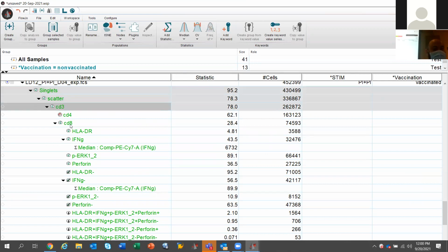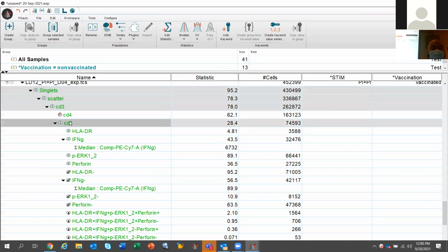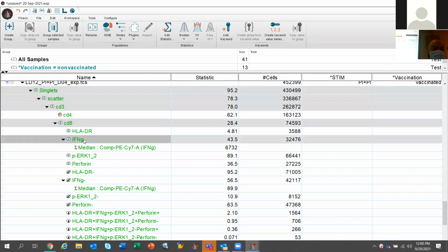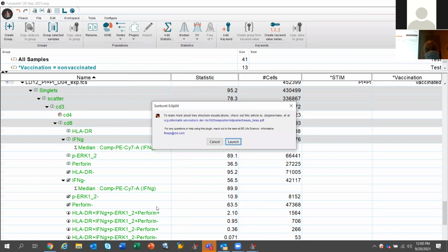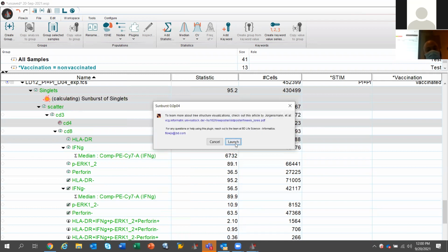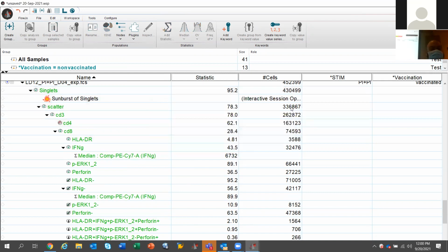This is also a really cool one. If you're doing a live demo of your work, or if you're able to add animations. I will recommend this one if you're going to a conference. People really enjoy this. You click on, again, workspace, plugins, and go to Sunburst. Just click on launch. Yes, again, I should have clicked on the parent, not this. I always forget.